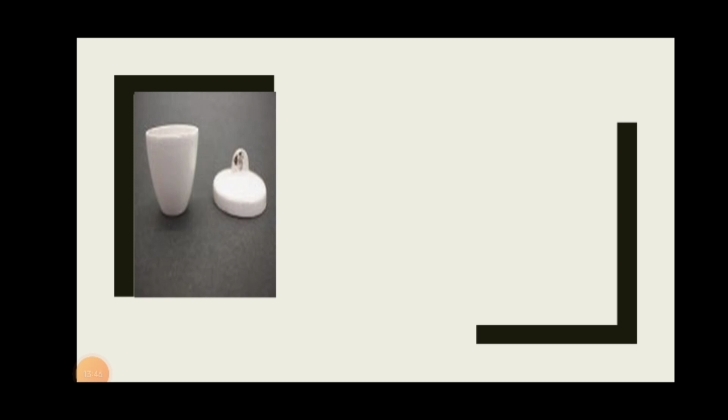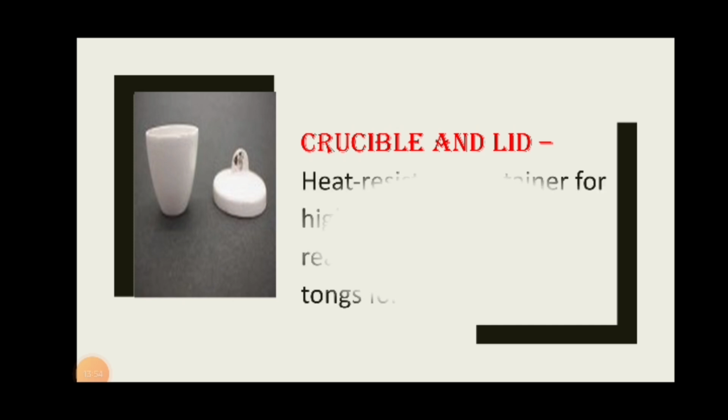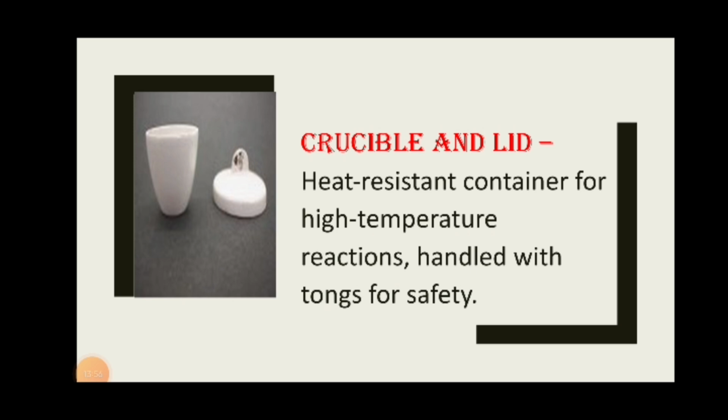Next is, yes, I heard you. That's crucible and lid, or sometimes commonly known as crucible and cover. Ano bang function nito? Heat-resistant container for high-temperature reactions handled with tongs for safety.